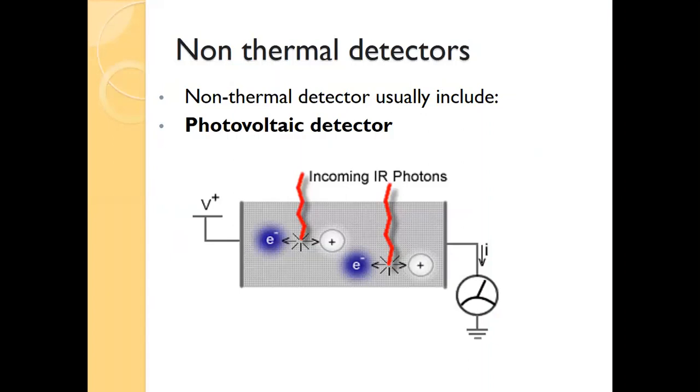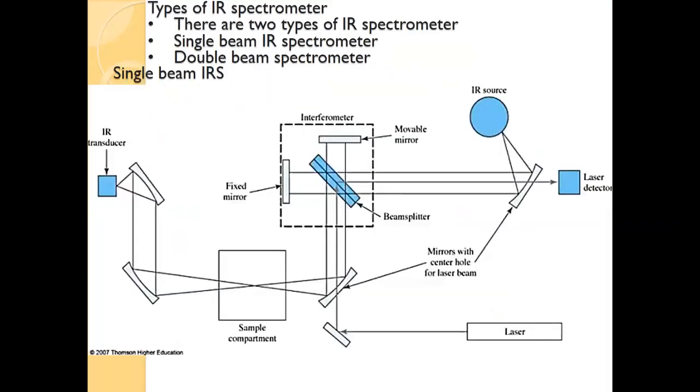Non-thermal detectors. Non-thermal detectors usually include photovoltaic detectors. Here you can see the picture.